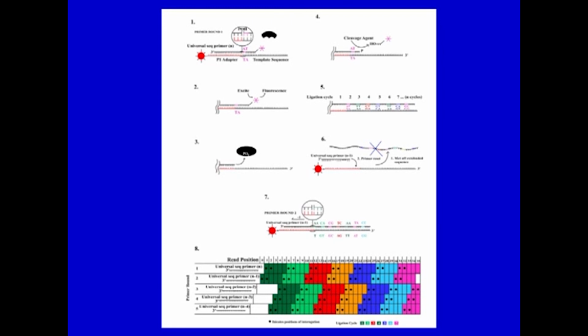Likewise, there is an overlap of these sequences, and finally you will get the full sequence as you go. Each time, ligation and priming reactions are performed with primers shortened by one nucleotide, and different probes.